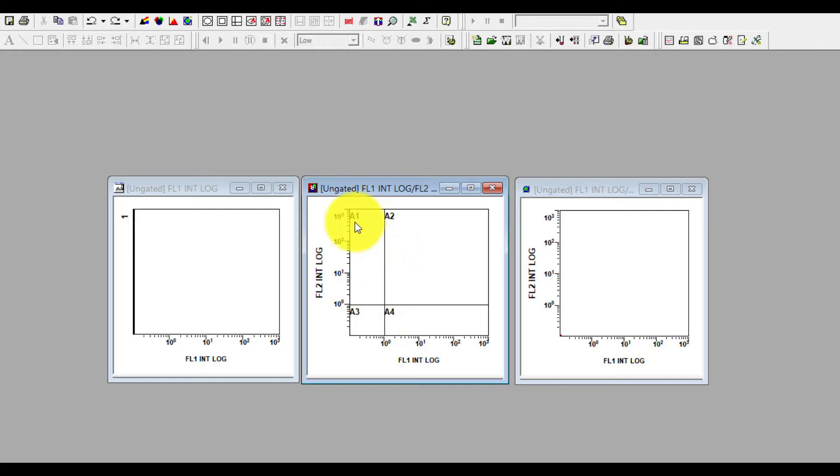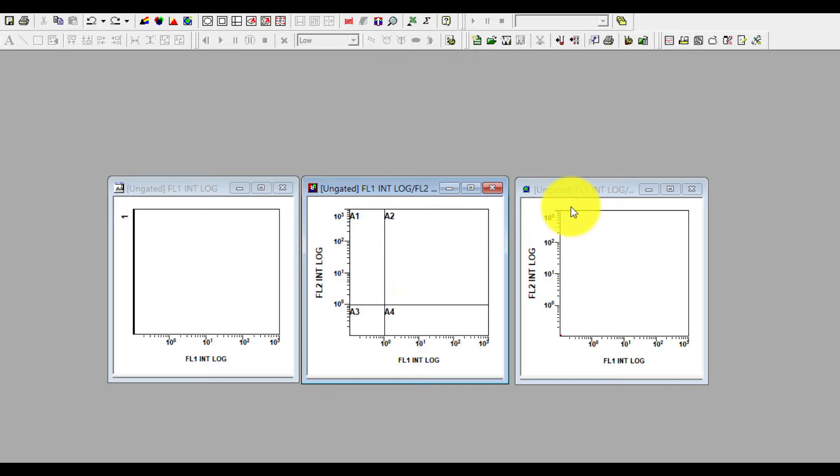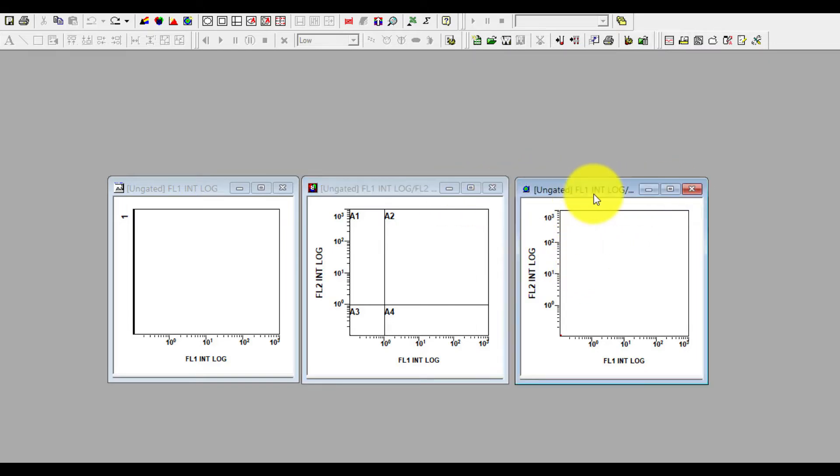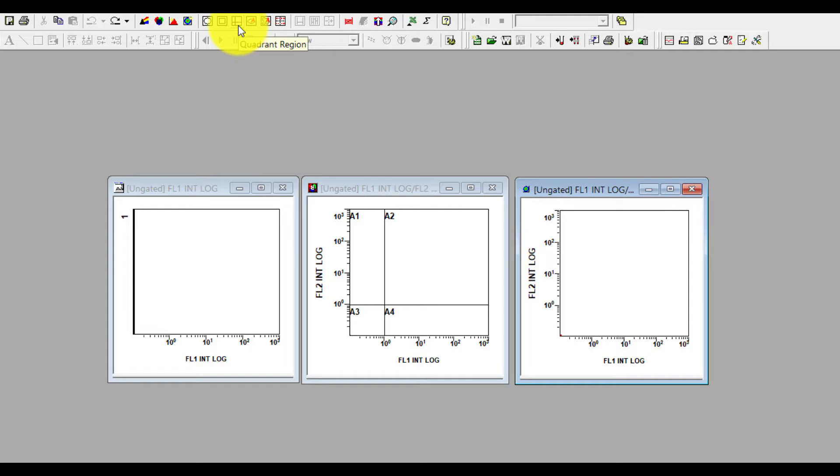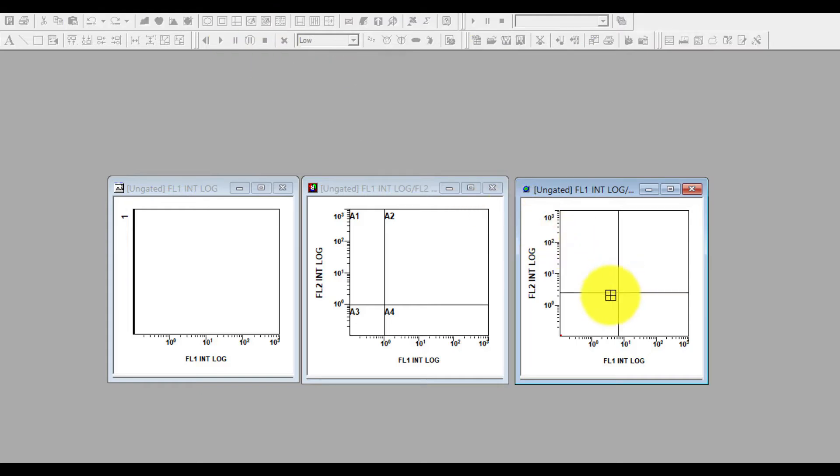In the next plot which is a density plot, there is still no quadrant. So how you can make a quadrant: select that one, go to the quadrant region, click on it and bring it here in the plot. Click in the plot and you can freely move the mouse, adjust it and click it.